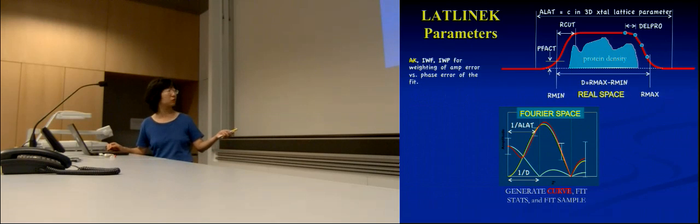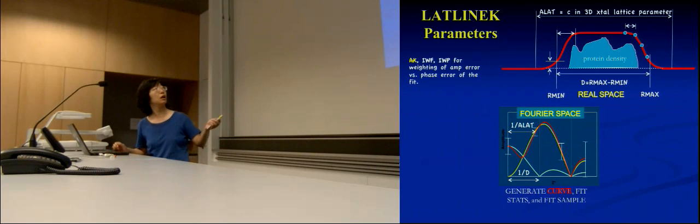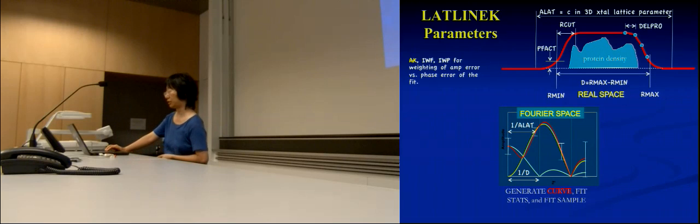Now, this part, if you know the form of the model, the program can take care of that. So you don't have to think about it. These are little details of your model, and they usually don't create a strong effect on your model. So that can be estimated as well. Basically, you just don't want it to be really sharp so that you get an aliasing effect in your transformation. So that usually doesn't cause that much harm.